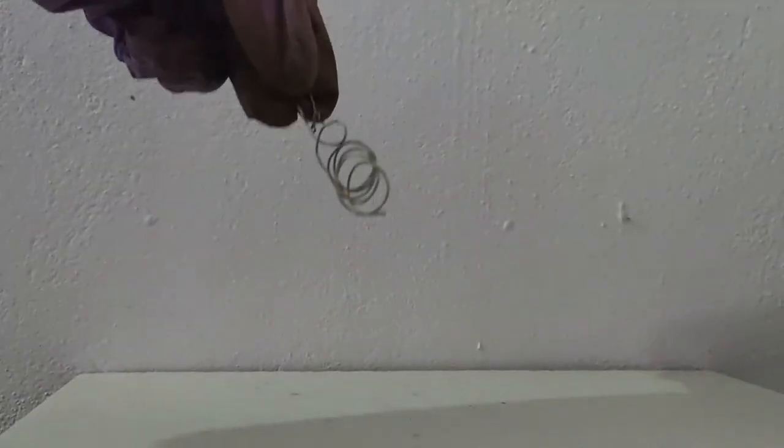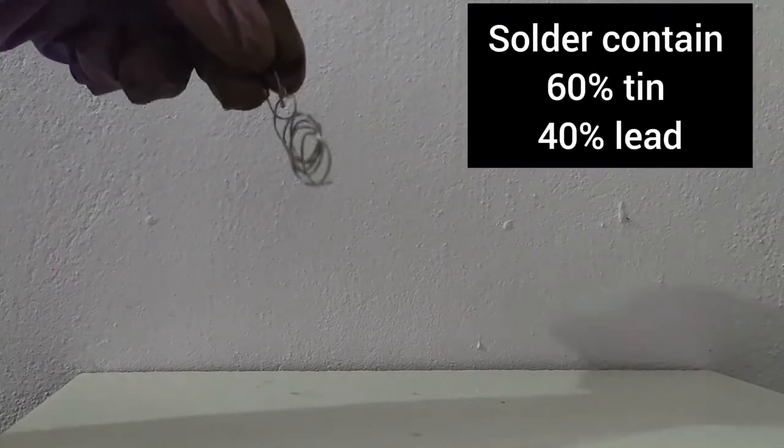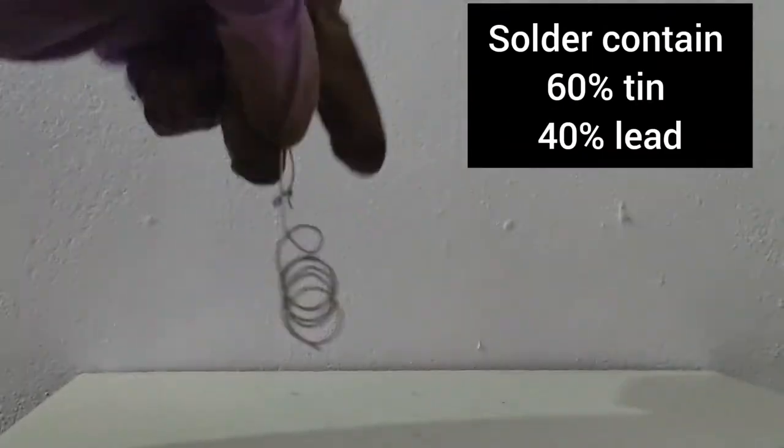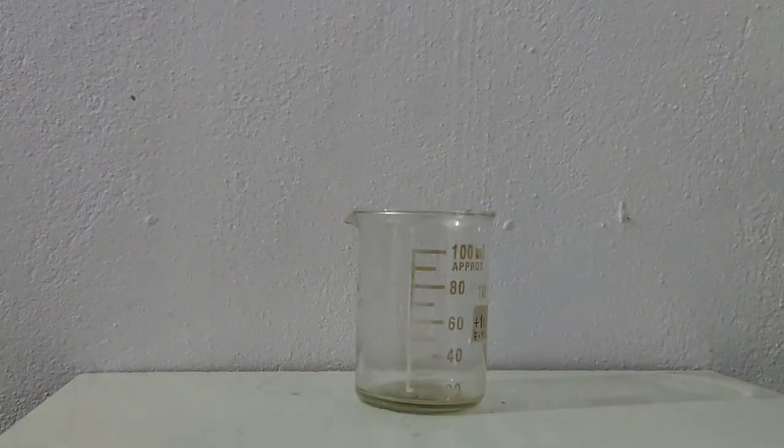Today, I will be extracting tin metal from solder wire. So over here I have solder wire. Solder contains 60% tin and 40% lead. So on basis of that, I am going to extract tin.